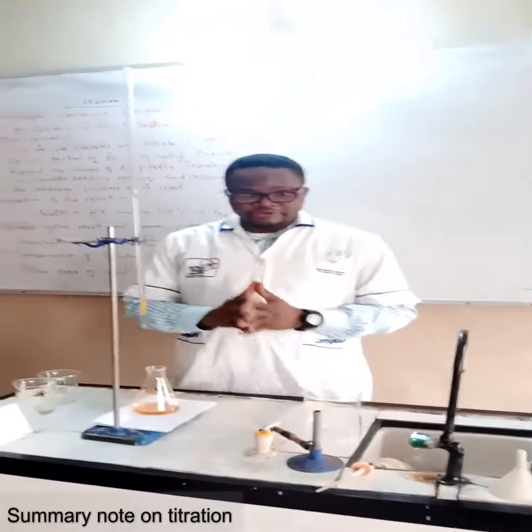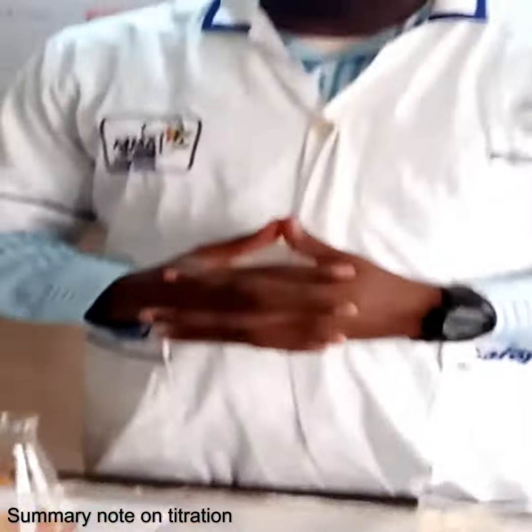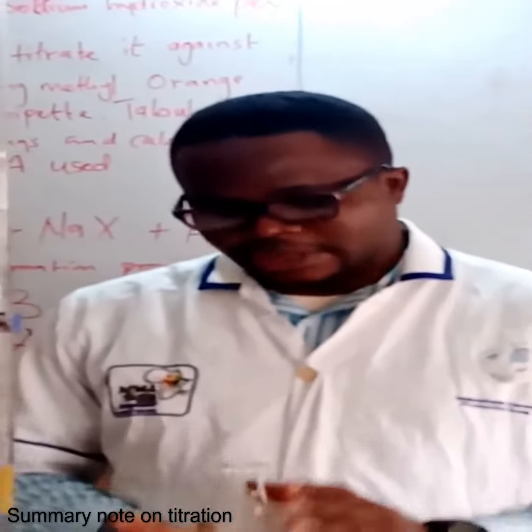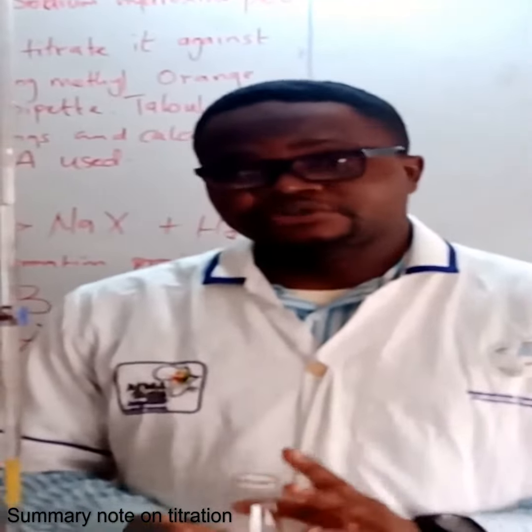Done the rough and the first titre value. So you will repeat the same procedure as you did for your first titre value to get your second titre value and the third titre value.